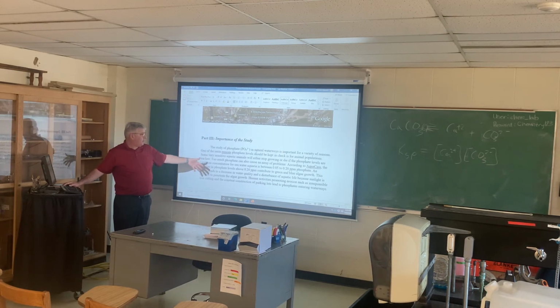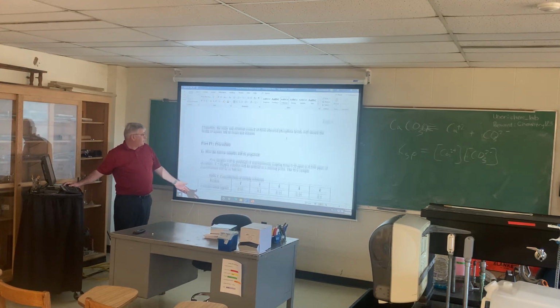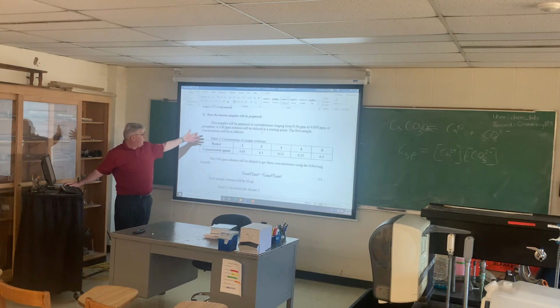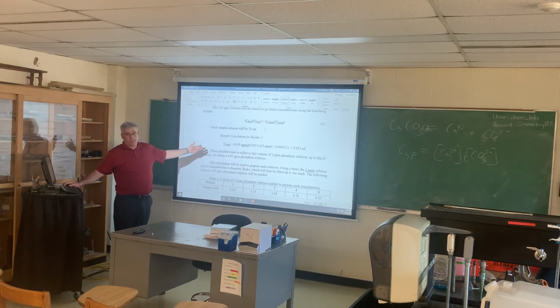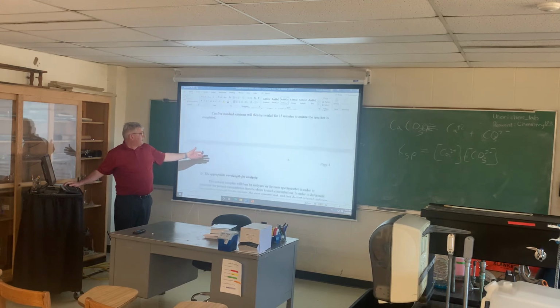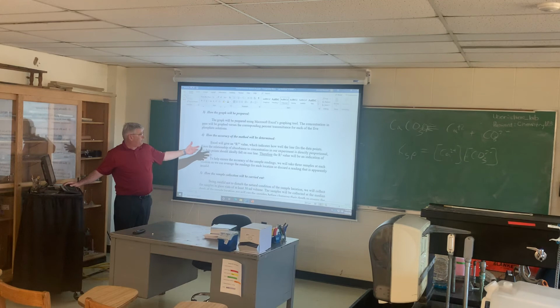They made an argument about that and what concentrations they were expecting. They did some literature work there, and how the samples will be prepared. If you notice, this is in detail. It goes through how each standard would be calculated, gave the concentrations of the standards, and ultimately the wavelength for analysis, how the graph will be prepared. I think that needs more detail.